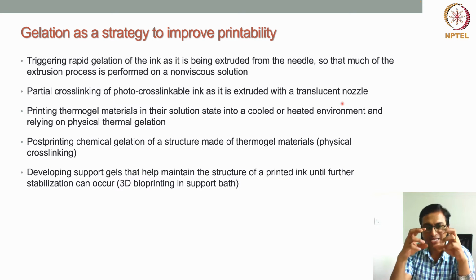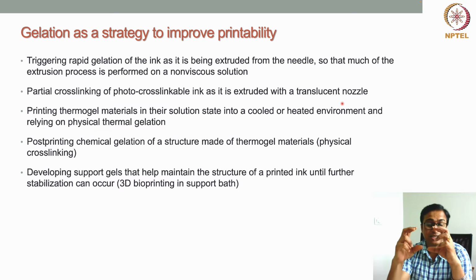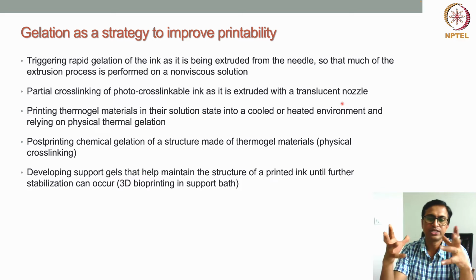That means the gelation can be started within the extrusion nozzle itself, but it takes time, and when the material comes out of the nozzle, the gelation is very fast and the material solidifies immediately. That means the shape can be retained very fast and the print fidelity would be very good in that case.